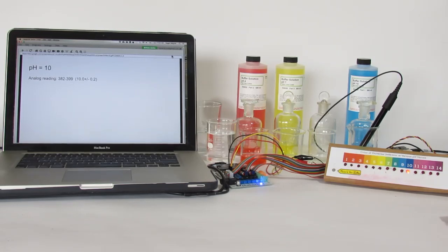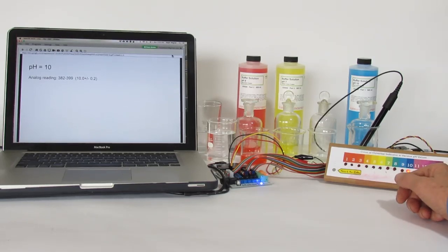This is actually a world's first using the BBC micro:bit, the MakerBit, and bringing up digital media in response to real-time measurements, in this case from a chemical reaction. To learn more go to MakerBit.com.